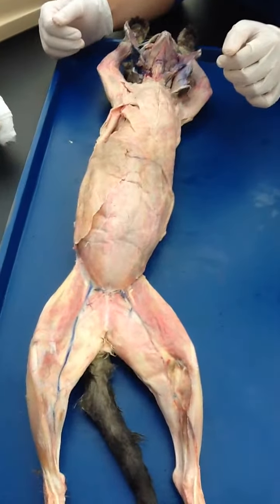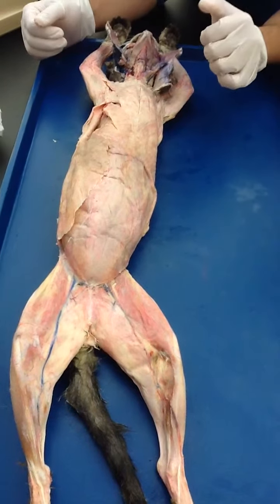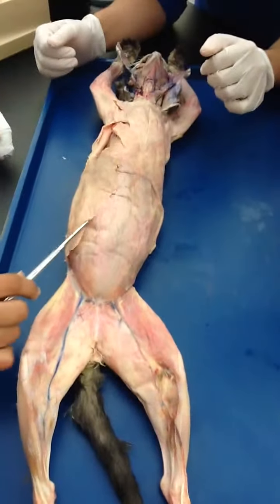Now, chest muscles are done. Now on to the abdomen — the outer layer.